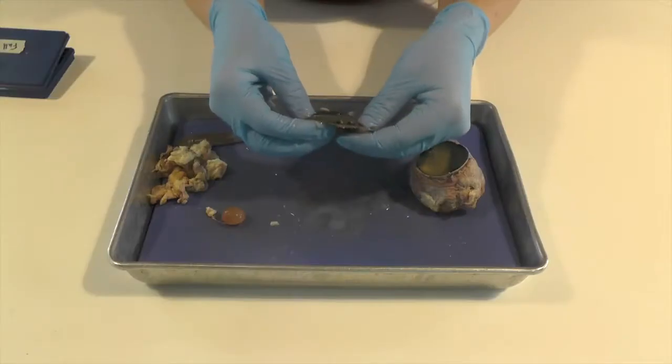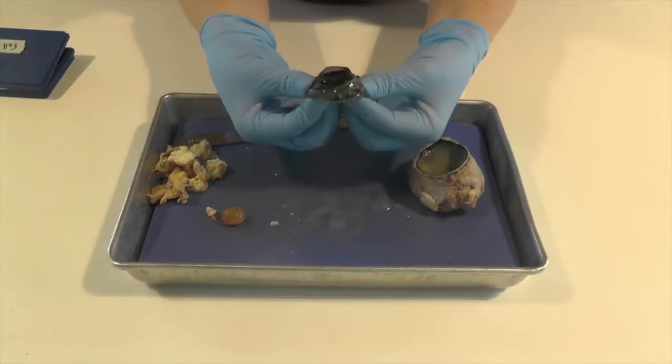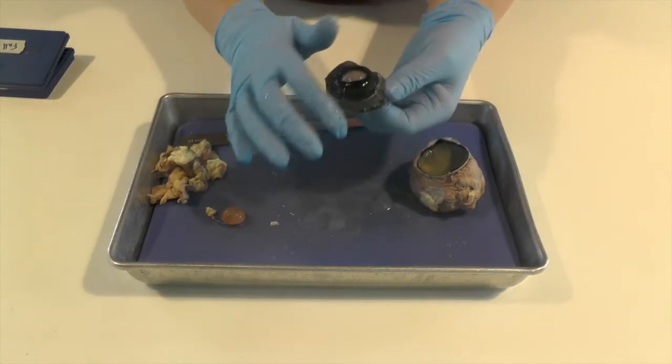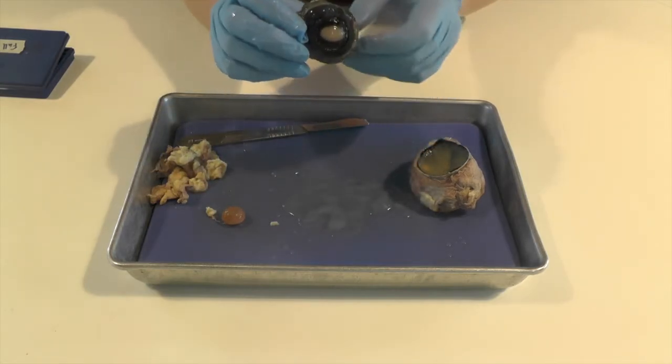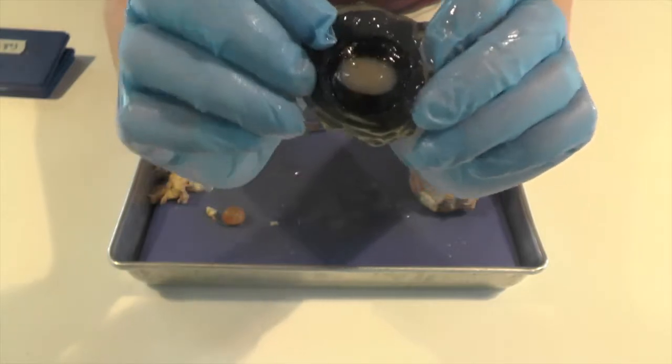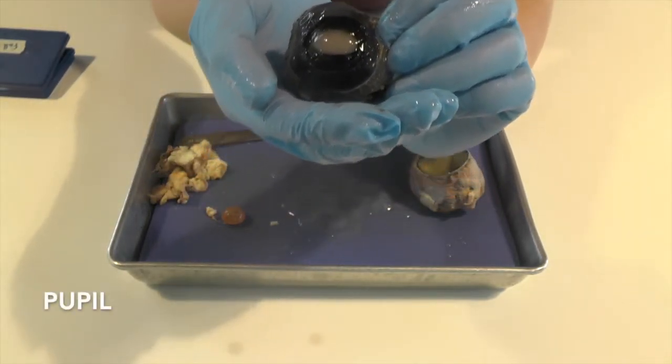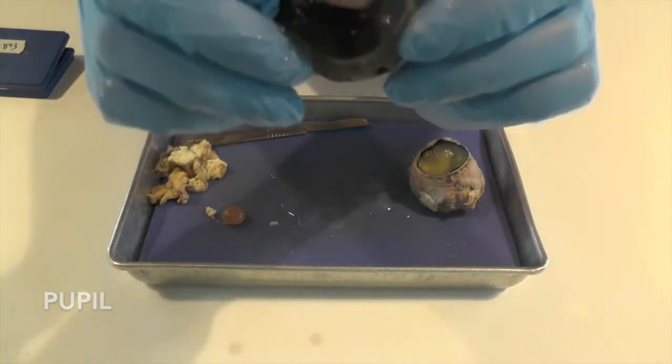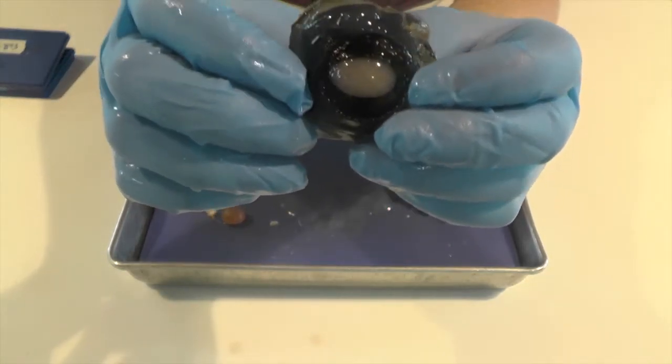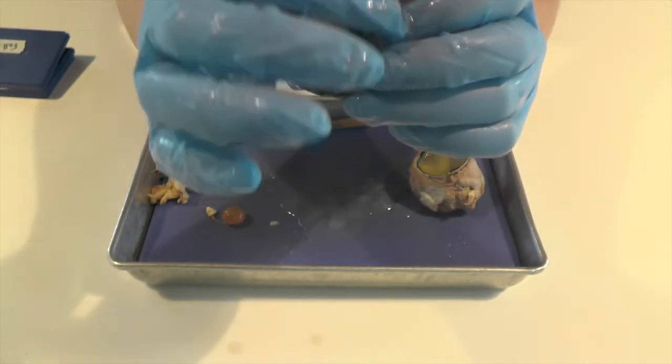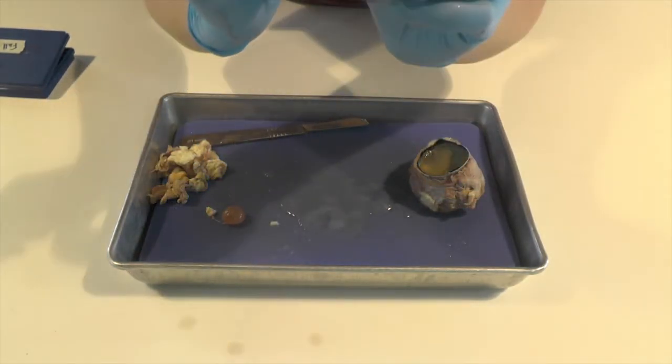And then if I turn our eyeball inside out, you can kind of get a better idea. So this is the pupil in the middle here. And our pupil is actually just a hole. And it's protected by the cornea, but it's just a hole to let light and information in. And then around the pupil here, you'll see the iris.